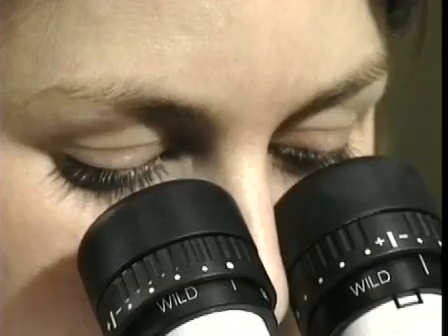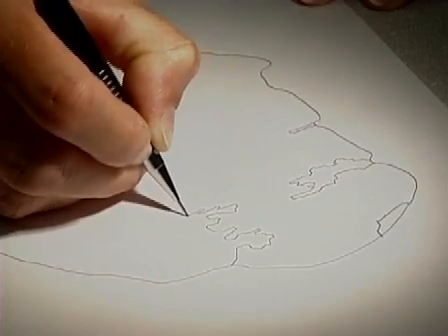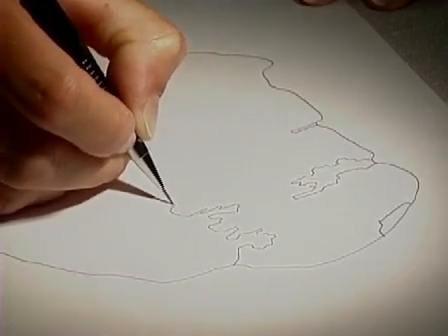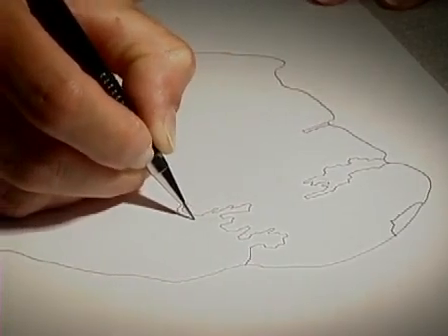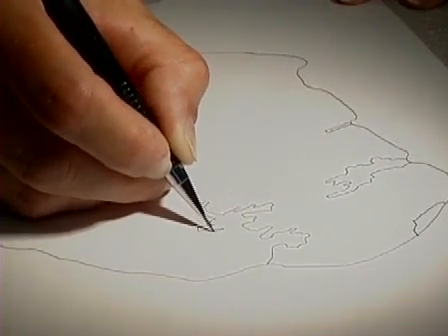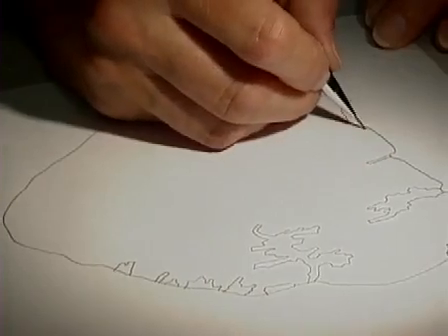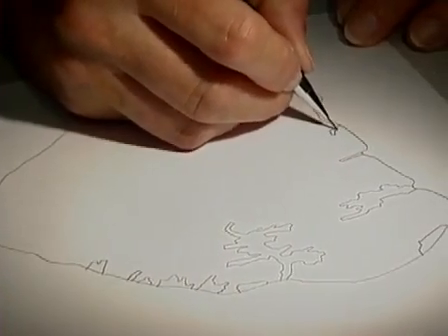Even the smallest, newly formed blood vessels, whose diameter at higher enlargements has been found to be around 2.5 to 3.0 micrometers, can be clearly discerned. The fact that the mean diameter of the rat erythrocyte is equal to or greater than 6.3 micrometers shows just how small these vessels are.